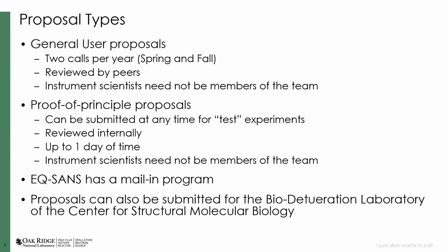I will also note that the EQ-SANS instrument has a mail-in program that anyone can get access to. It has some restrictions on it, and if you go to the EQ-SANS instrument page at neutrons.ornl.gov, you can get more information on the mail-in program. Those are intended for measurements of less than a day, a limited number of samples, a limited number of sample environments, conditions that can be measured. The goal is to provide someone with the opportunity to have access to the instruments for some simple measurements without them having to get on a plane and come here. We are happy to have you come here. It would be great when COVID is over. We would love to have more of you here, but we're working towards that.